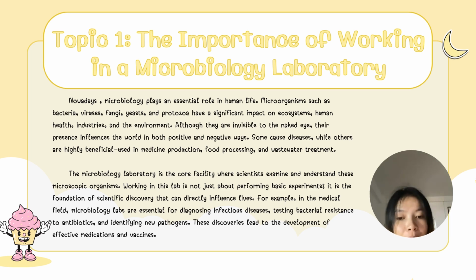Let's move on to topic 1, the importance of working in a microbiology laboratory. Nowadays, microbiology plays an essential role in human life. Microorganisms such as bacteria, viruses, fungi, yeast, and protozoa have a significant impact on ecosystems, human health, industries, and the environment.